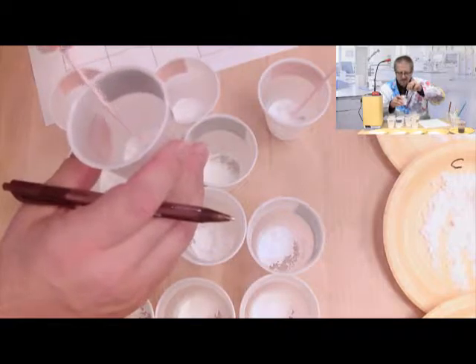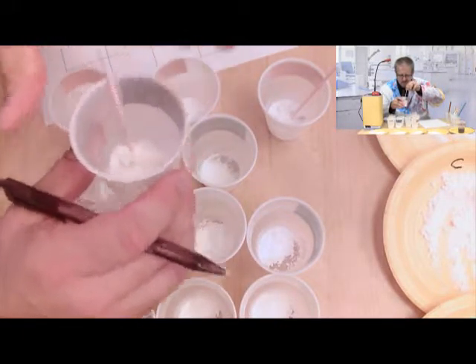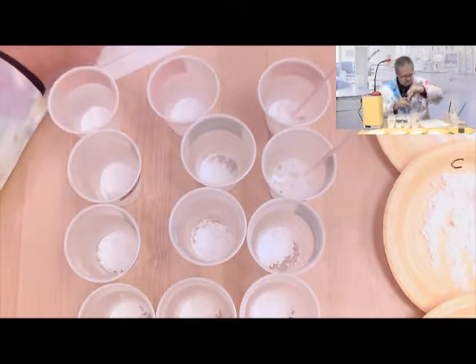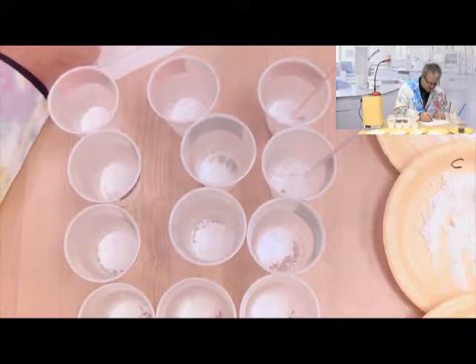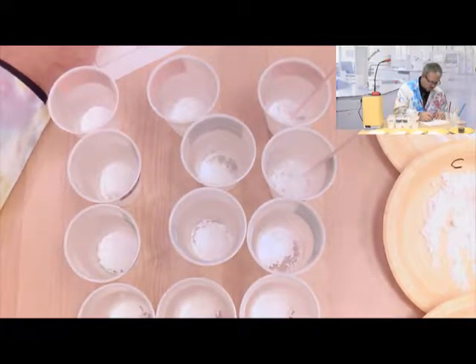Let's get a stir. Okay, that's good. So B mixed with water fizzed, bubbled, sounded like a frying pan.